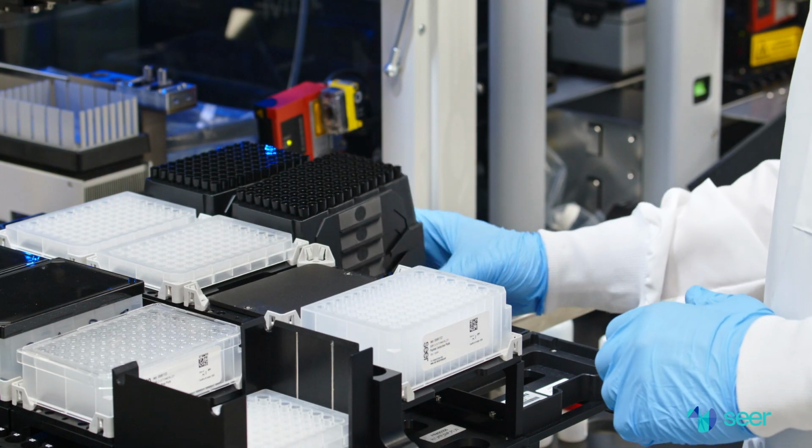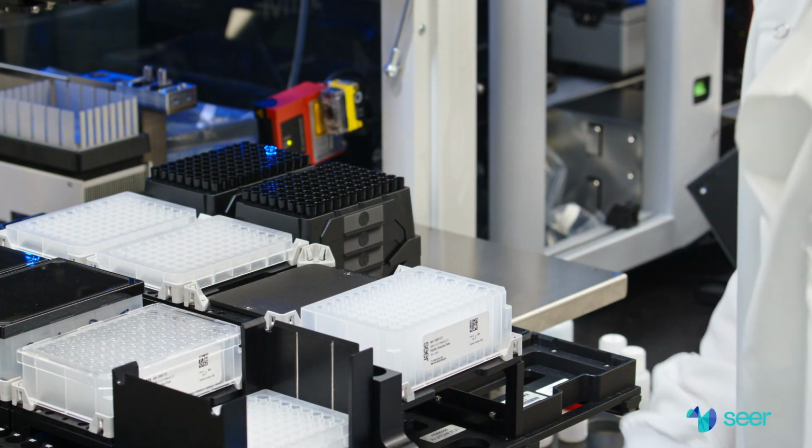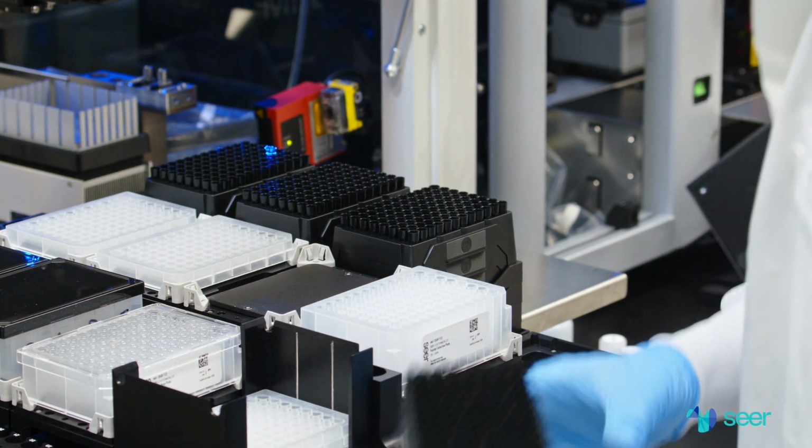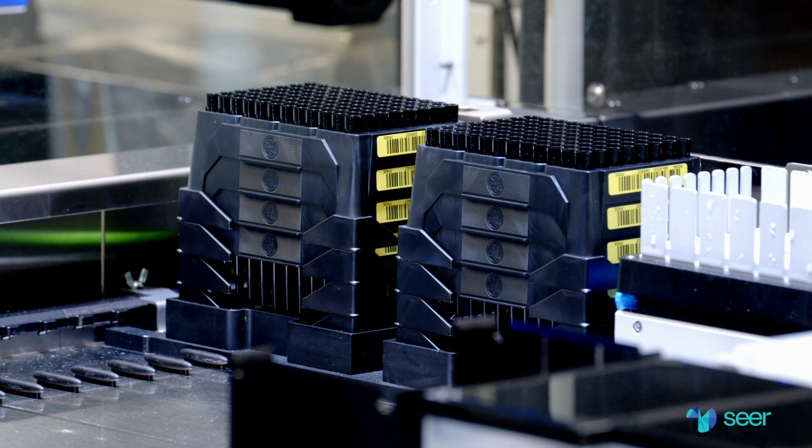Next, we will load the tips. Place 1 stack, which is 4 racks of nested conductive tips in position C2 to C5. Verify that there are a sufficient number of tips in positions D1 and D2. Now, we are ready to reconstitute the trypsin.